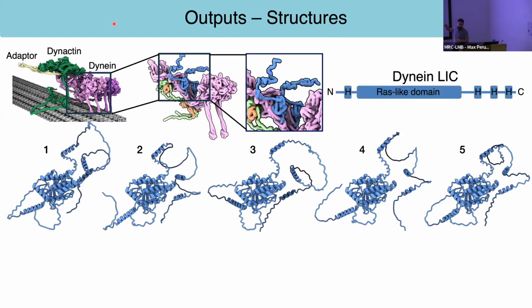It's a nice example because it has this globular domain and then these alpha helices that are connected by flexible loops. Let's see what AlphaFold does with this protein. You can see we have our globular domain, and then we have our alpha helices floating in space. It's placed these alpha helices randomly in space, and probably the positions of these things are not accurate, right? But we need a good way to interpret this, right?